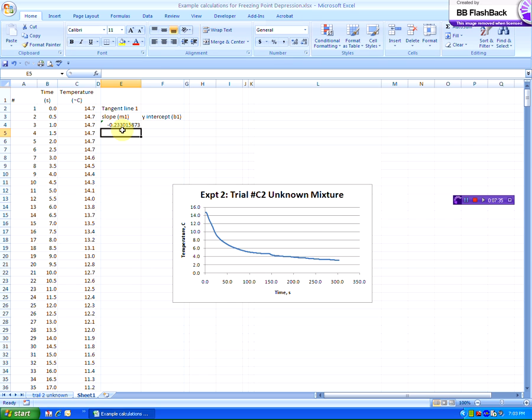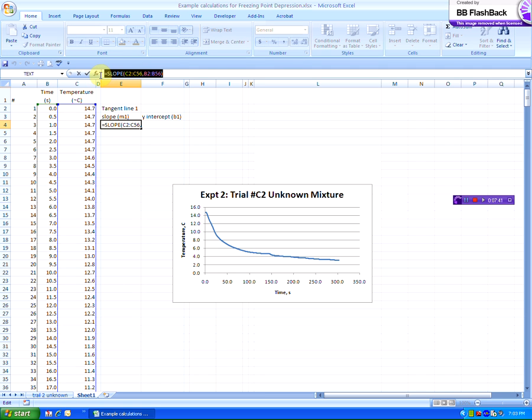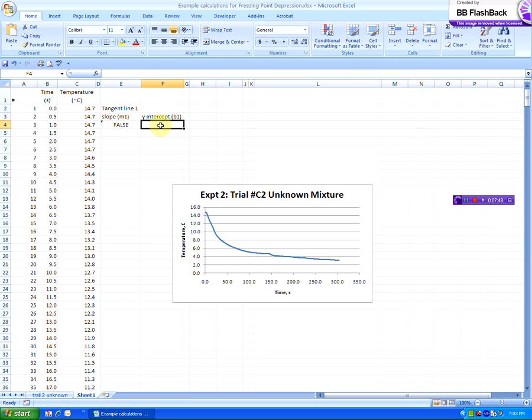So that's my slope for the first part. I'm also going to highlight that and copy this over, copy and paste, and it shouldn't have done that. Control Z fixes everything, right? So I'm just going to copy and paste this way.